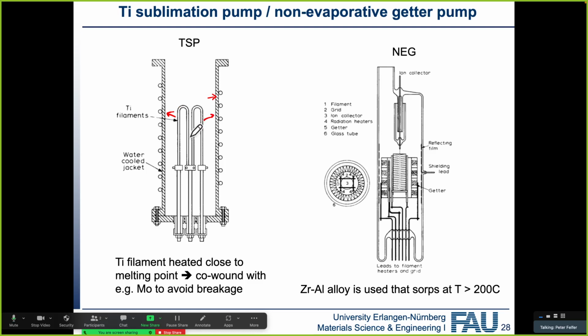For us, typically, when we work in ultra-high vacuum, we do a run of titanium sublimation, and then that's good for a couple of days or a couple of weeks. But if you're in semiconductor processing equipment, you might have them running constantly, and then you need some water cooling in order for continuous sublimation to happen. But these are very practical, very easy to run pumps.